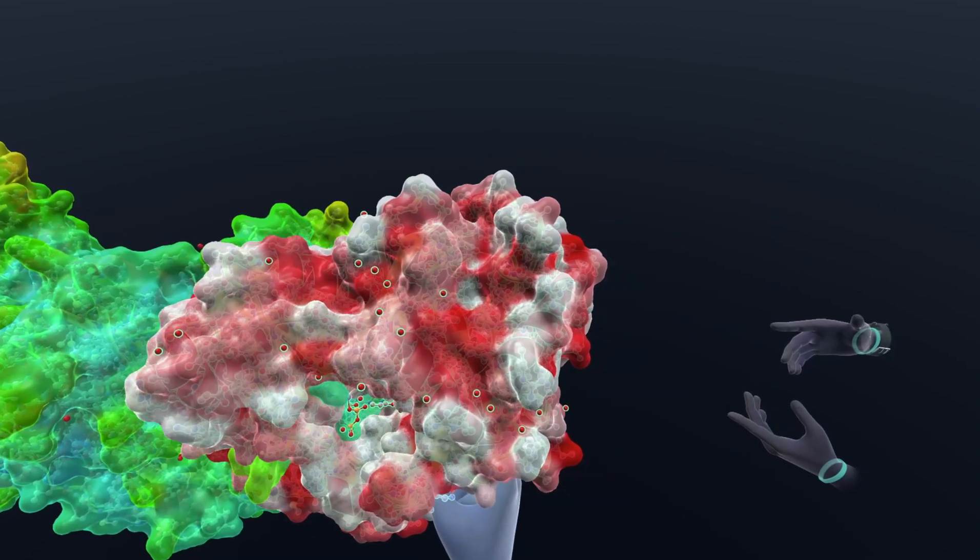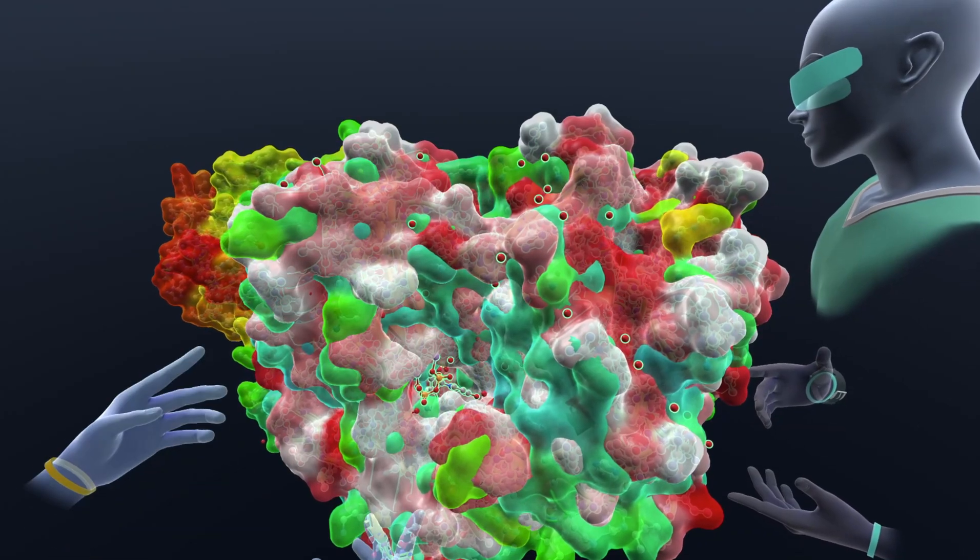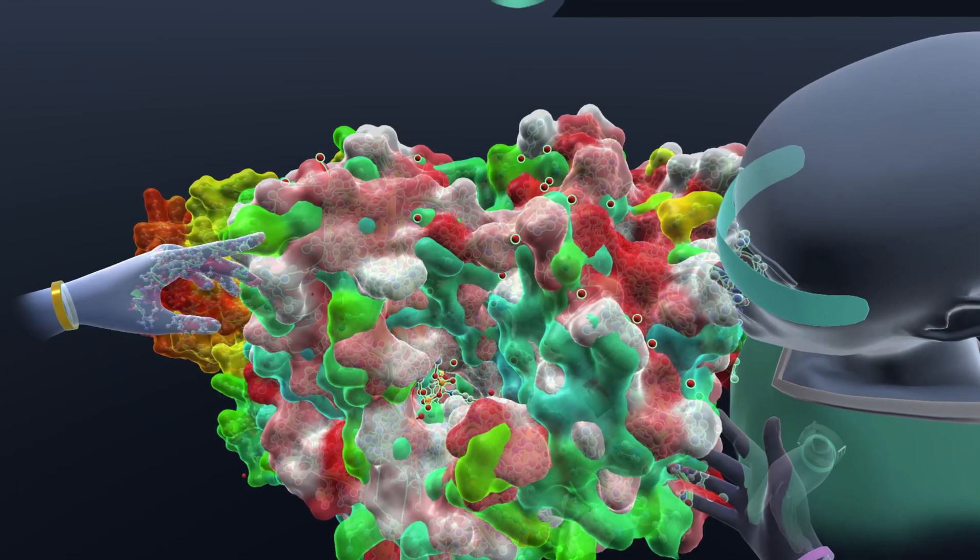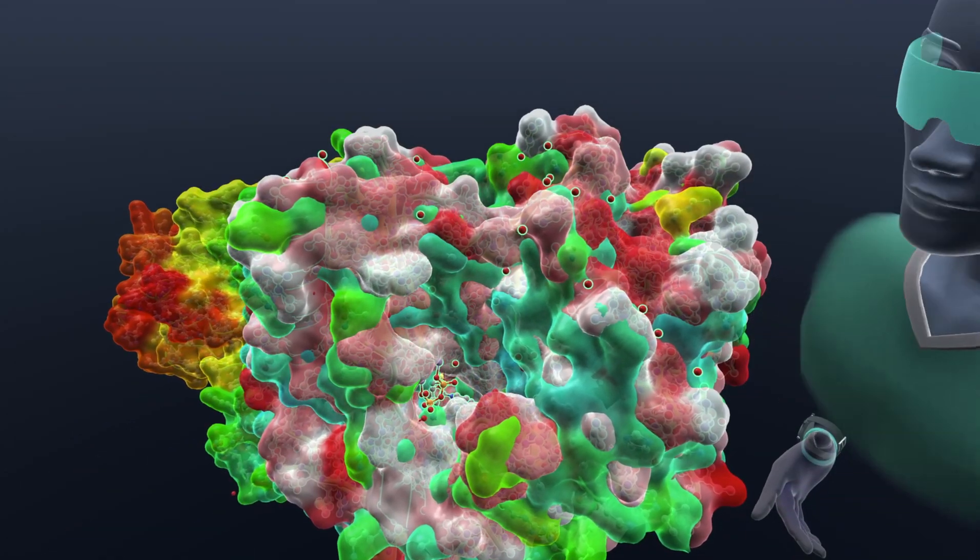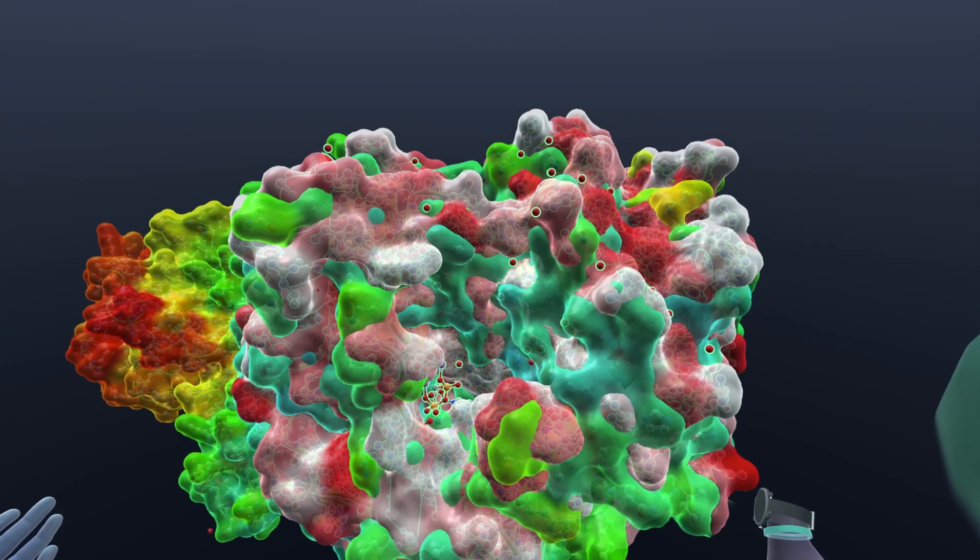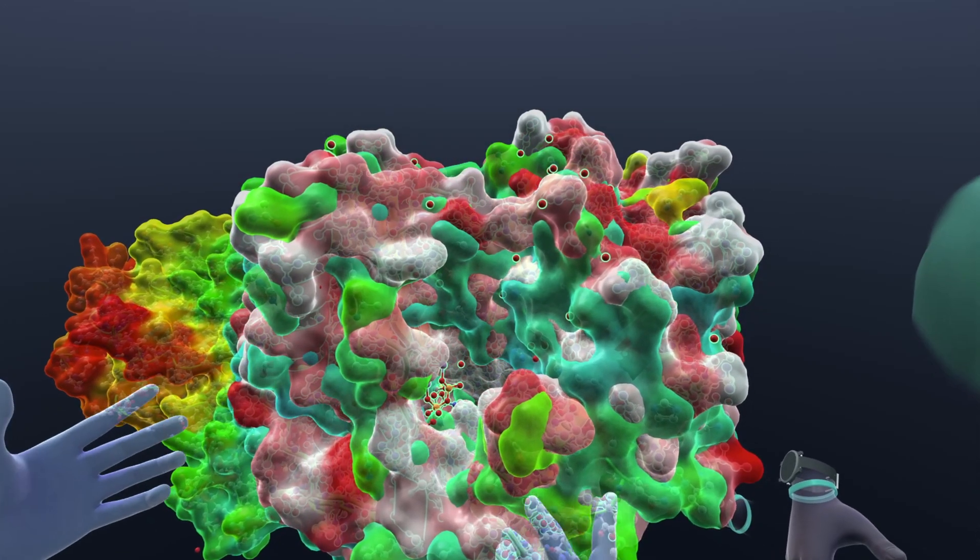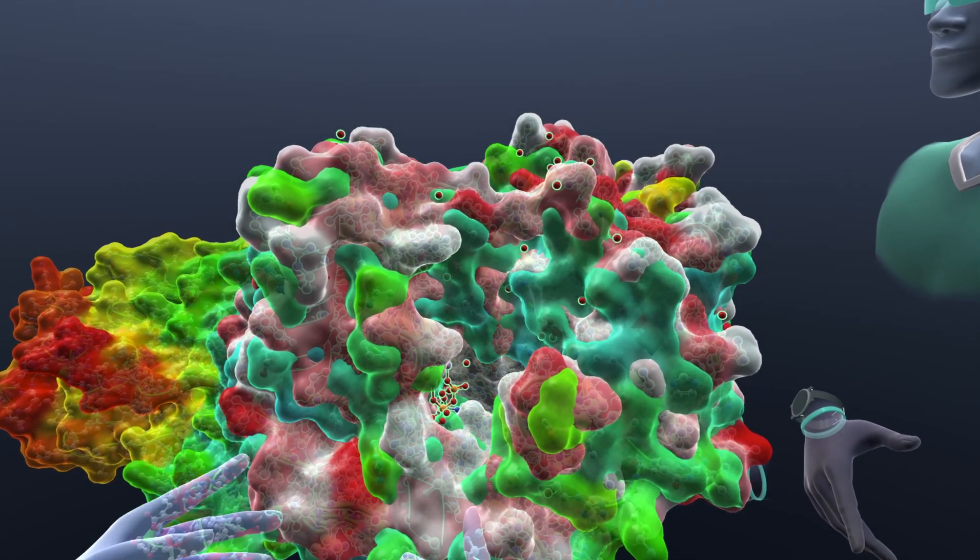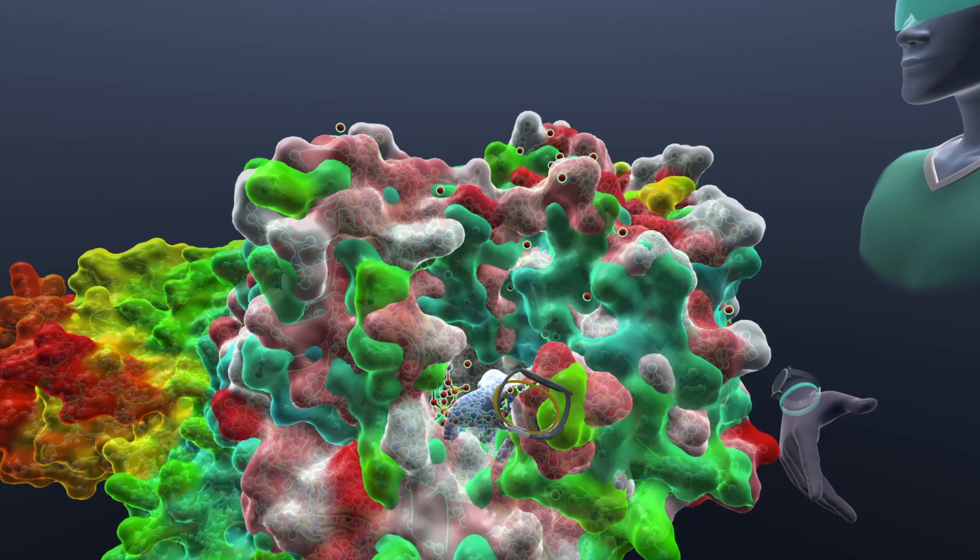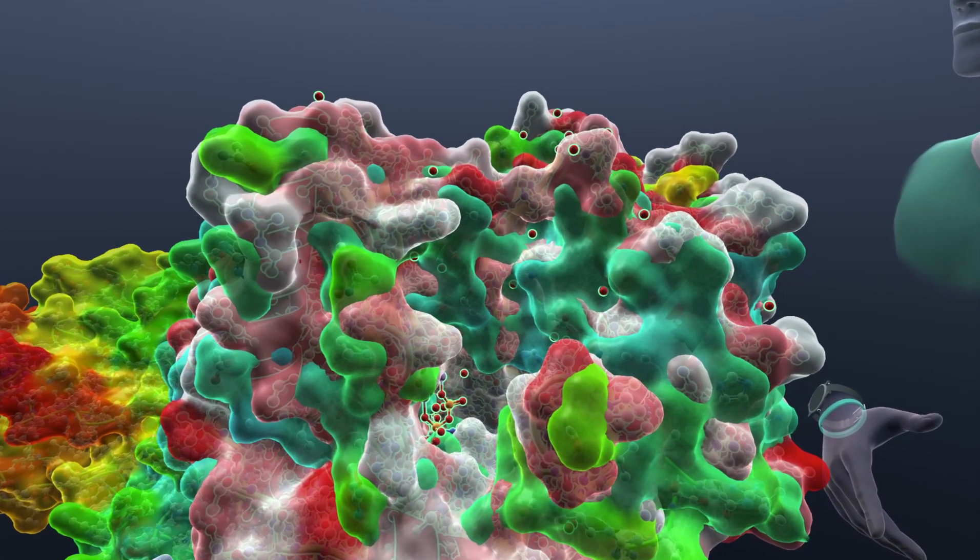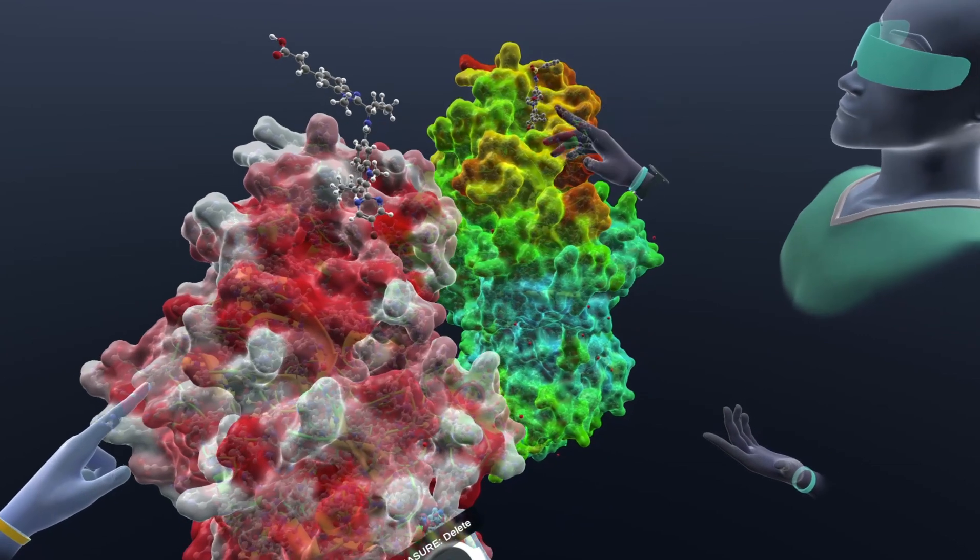We can roughly just put it over there and you can see interestingly that the conformation of 4GTW is significantly different from 4GMC, enough that it really doesn't properly overlap. This says a lot about x-ray crystallography and also the effects of these ligands on the conformation of the protein.